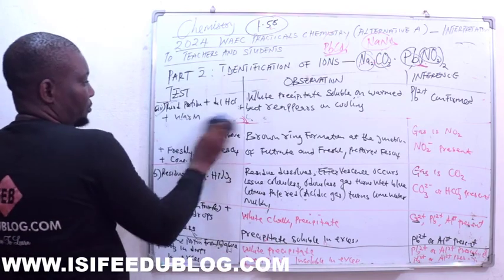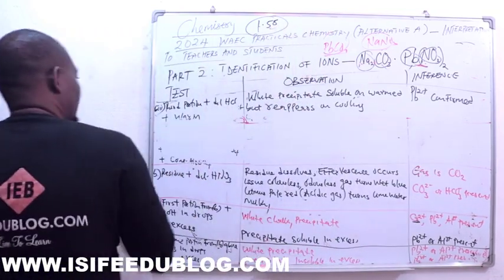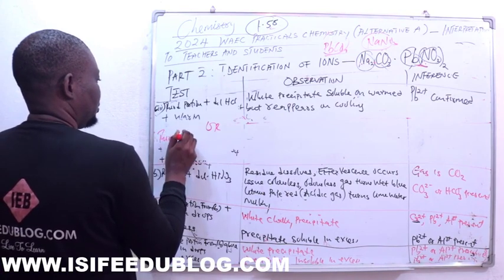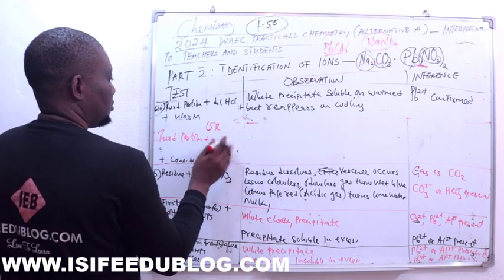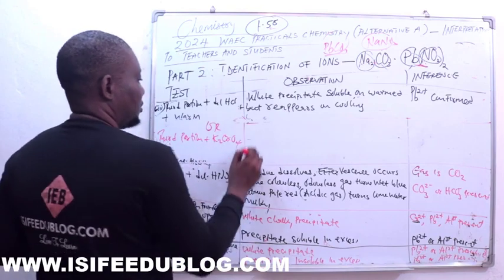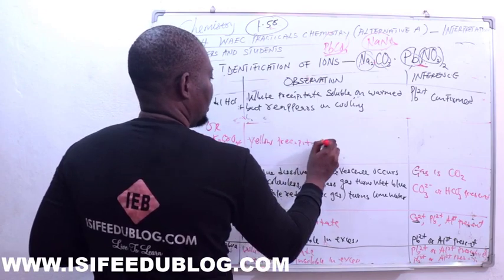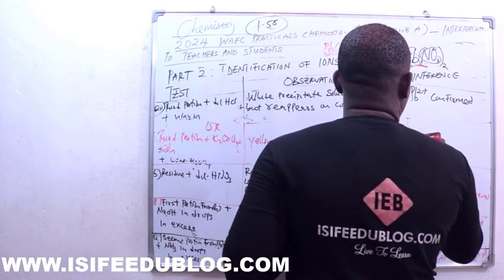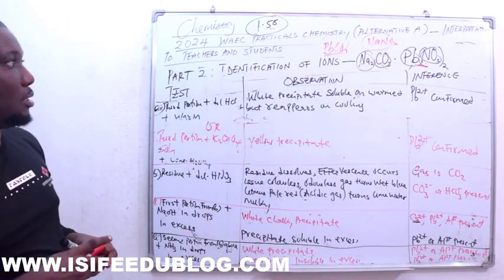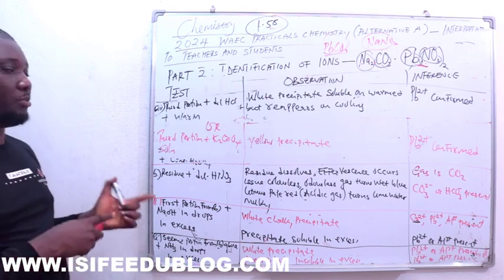Since there is provision for a lead solution, that could also play a part. Or the third portion plus K2CrO4 solution, with that you're going to have a yellow precipitate. Lead is confirmed. So this is how the practical aspect of this part should be reported.